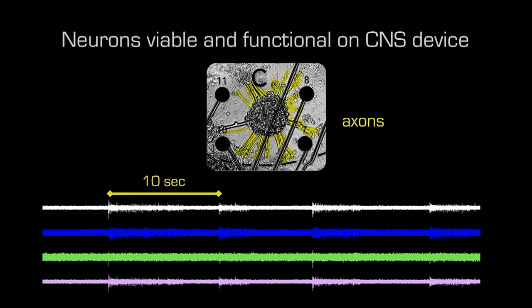And what we see is every few seconds, there's a flurry of activity. The neurons start firing action potentials kind of together all around the same time. And then there's a little lull, and then it starts up again. So what emerges is this rhythm of activity from the crowd of neurons itself. We call this bursting. So now we're going to have another demo to understand a little bit more about the different types of signals we can get from neurons and what it can tell us.